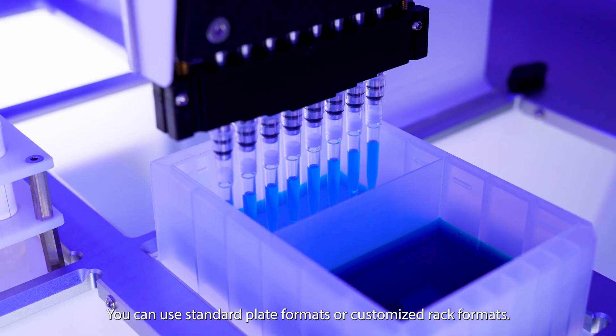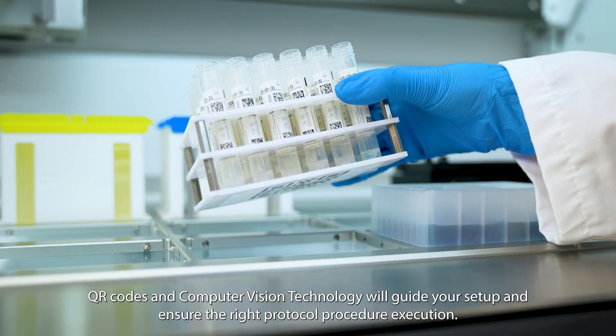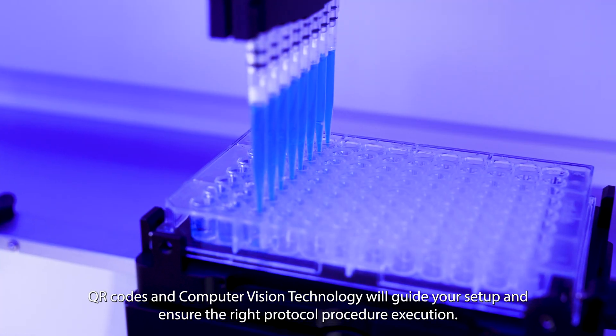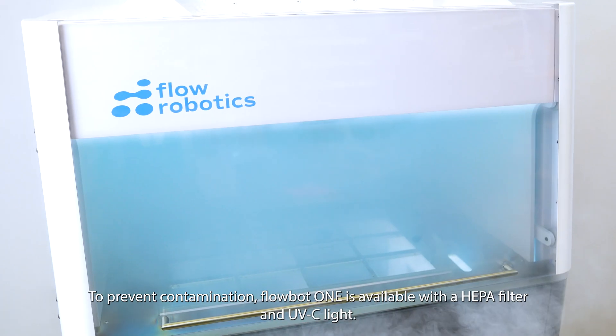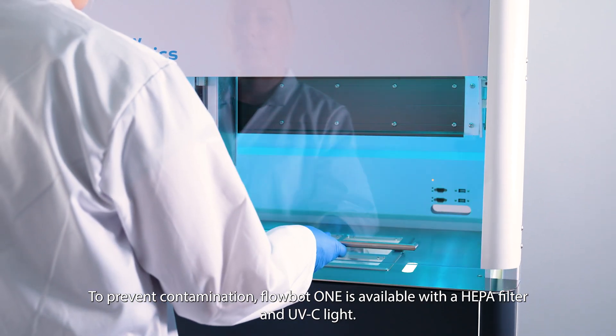You can use standard plate formats or customized rack formats. QR codes and computer vision technology will guide your setup and ensure the right protocol procedure execution. To prevent contamination, FlowBot One is available with a HEPA filter and UVC light.